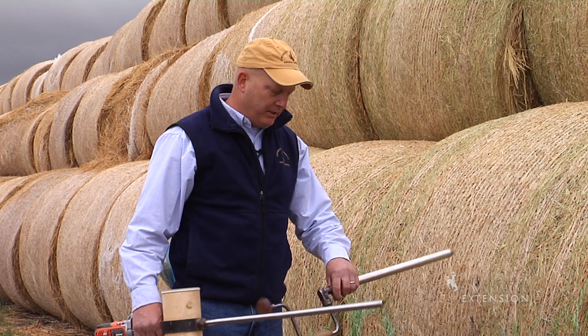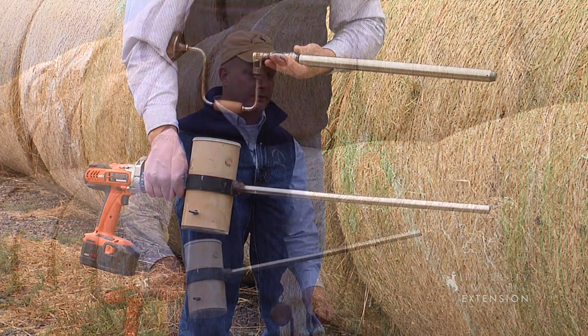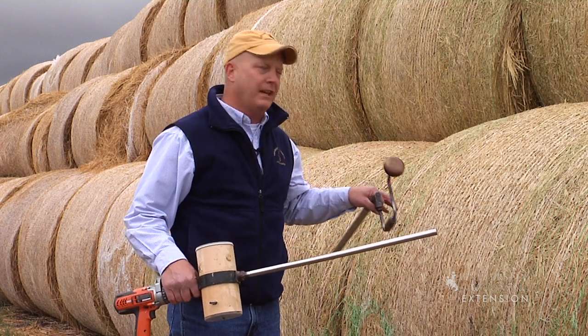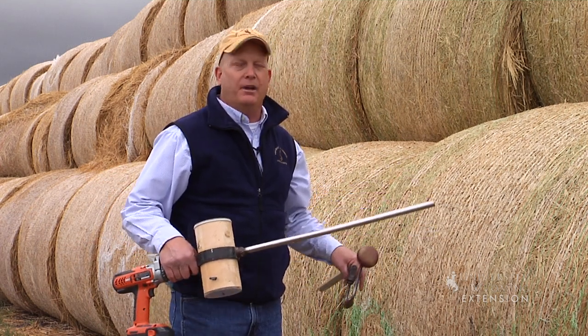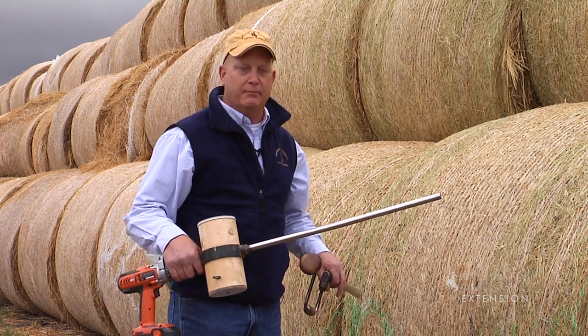What I have with me this morning are a couple of different hay probes. It's important to consider using a hay probe because we don't only want sampling from the outside of the bale — we also want to core into the middle of the bale to get a better representation of what's in the bale.